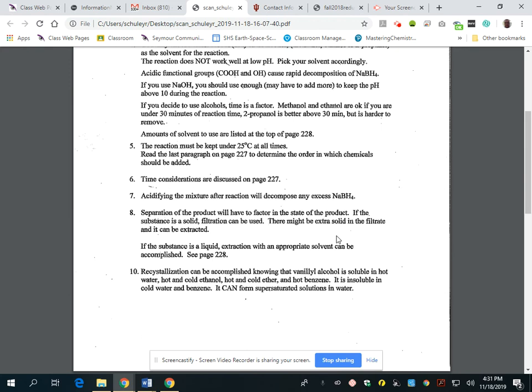Because as you're doing the final experiment, which is not a long one at all, basically it's just going to be running materials through the UV machine. You're going to have plenty of time to do a melting point, although that does give you 2 reports for the final night.